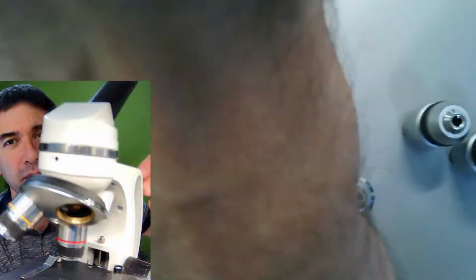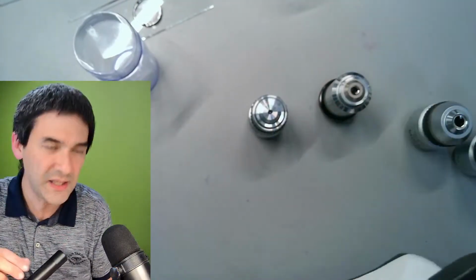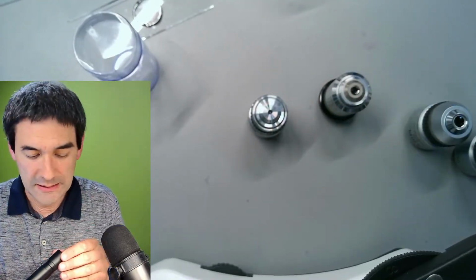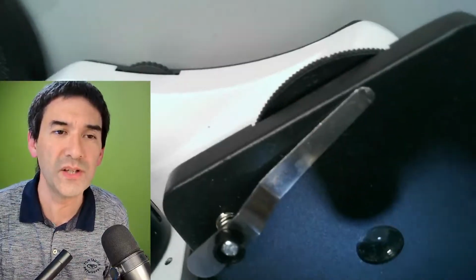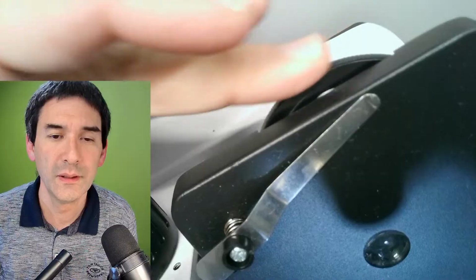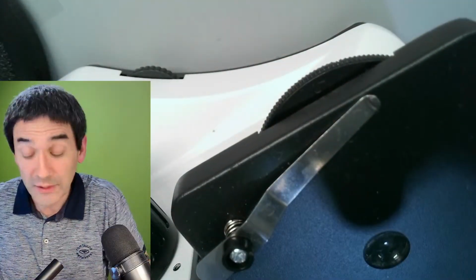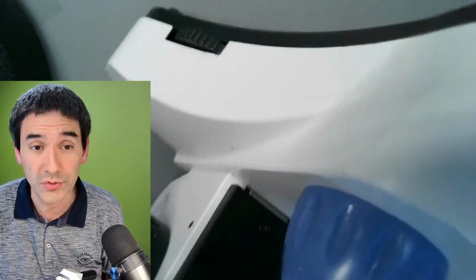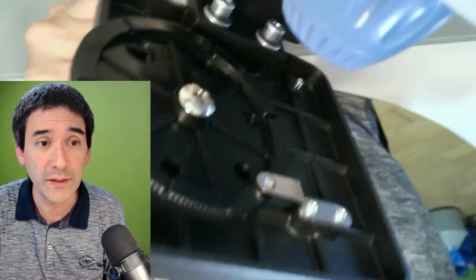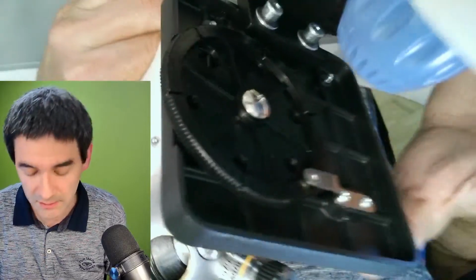Can I do a little rant here as well? I'm just going to tell you a complaint generally about those, and I don't understand why. I just have to say it. Look, here now you see this ring here that you can turn. And what does this ring do? It is so sad, and I don't get it, why the microscope manufacturers don't correct for that. Look, here it's the bottom view. It's just a plastic disc.